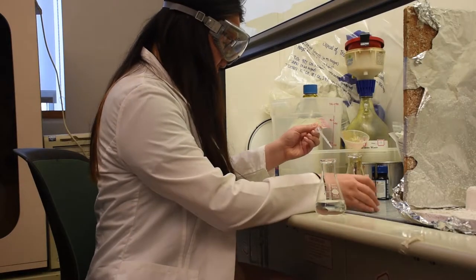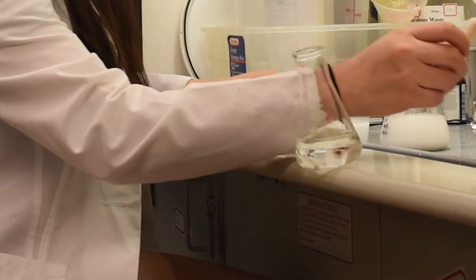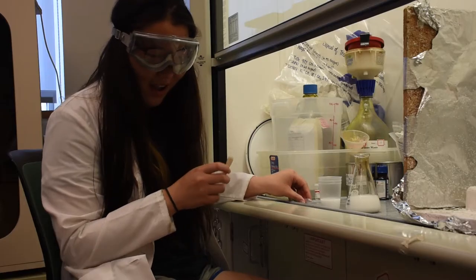Courtney is working on an experiment. All of a sudden, she accidentally knocks over a flask containing an acid or base. What should Courtney do?